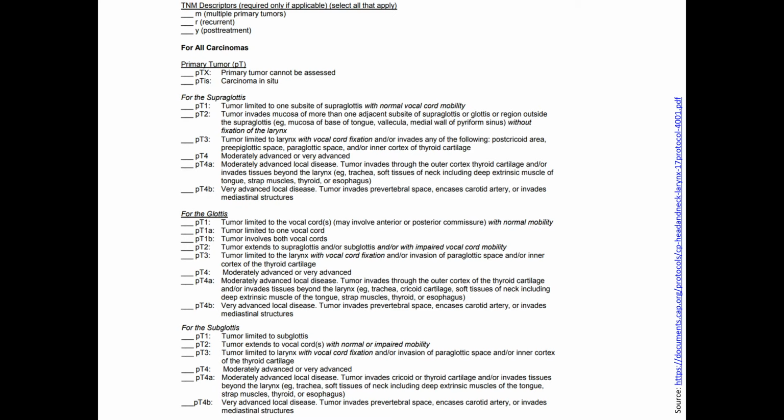All right. So photographs are definitely important with head and neck specimens, and definitely critical in your ability to correlate what they're seeing clinically and what we're seeing grossly, and histologically. So does that endoscopy information factor into the staging criteria?